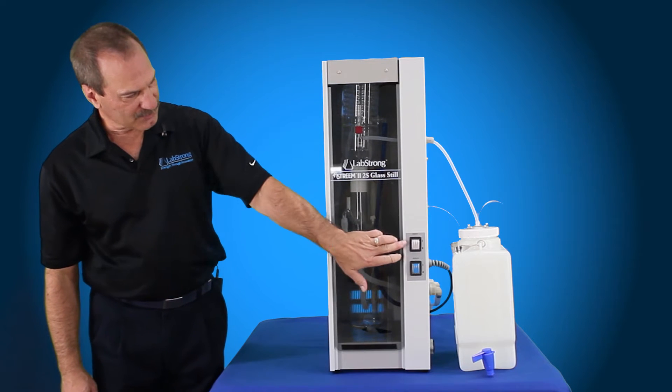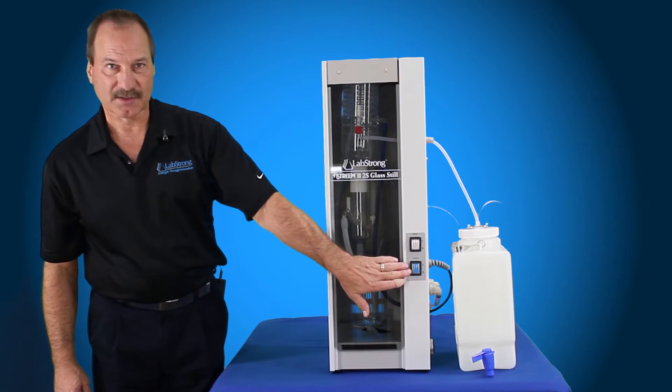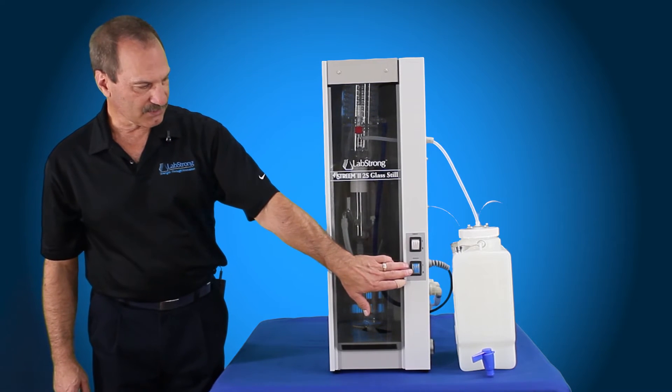There's a power switch in the front — the clear switch — and then there's a heater switch, the green switch. This is the same whether it's the 120-volt system or the 220-volt system.